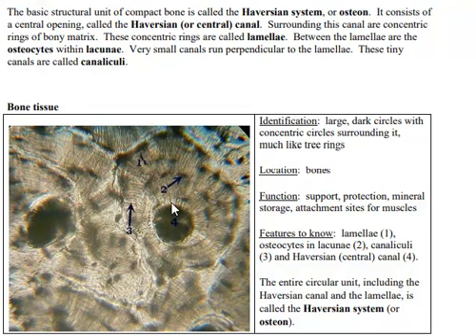So it's going to allow blood vessels and things to go through there. And then radiating out from it looks like tree rings. So here's a tree ring, here's a tree ring, here's a tree ring. And these rings are known as lamella. And there's all of these little things right there, your lacuna with your osteocytes in them.